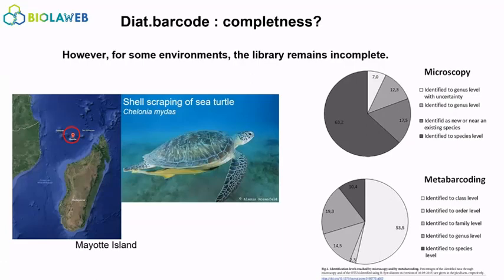Did you add those barcodes now in the library? No, it was really a lot of work. There were too many unidentified sequences to have.